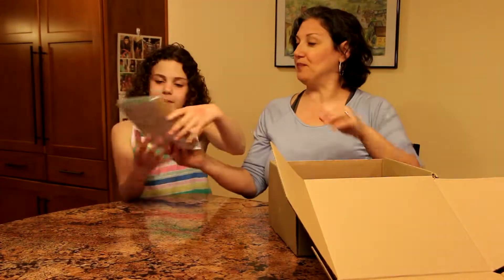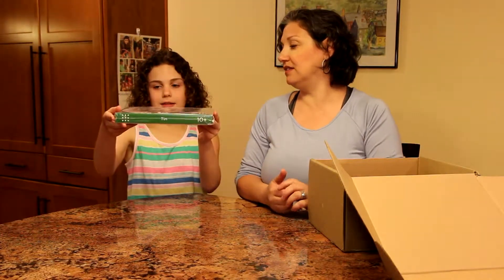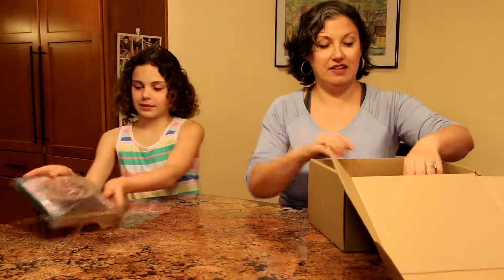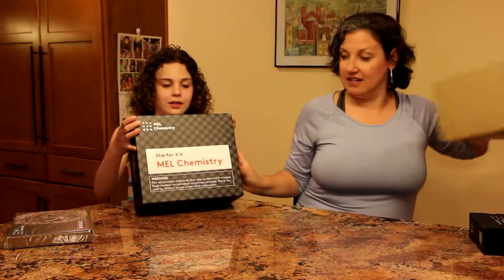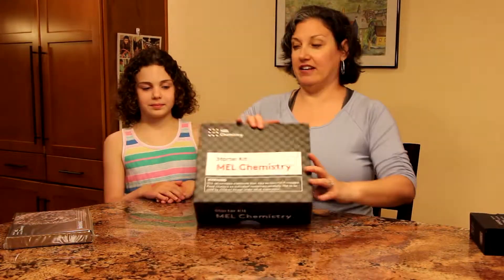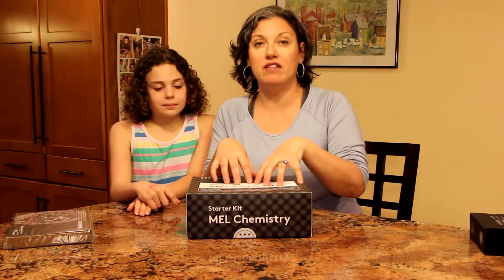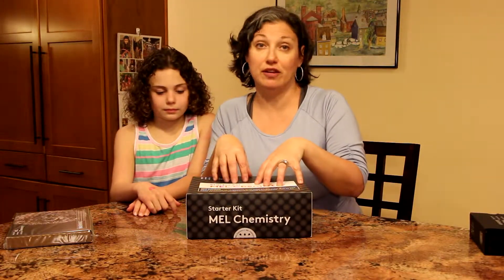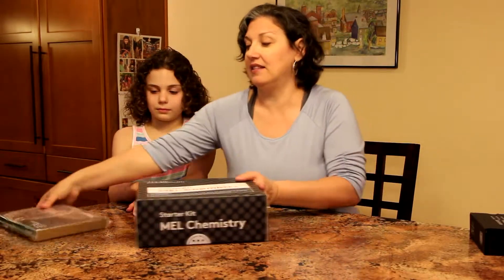Alright, what's this? MEL Chemistry Tin Lab. It's the Tin Lab. Set it over there. And then this is the Starter Kit MEL Chemistry. So they send you a starter kit so that you have all of the things that you'll need to run your labs in the future. We'll take a look at that in a minute. Let's set that aside and look at the VR headset.